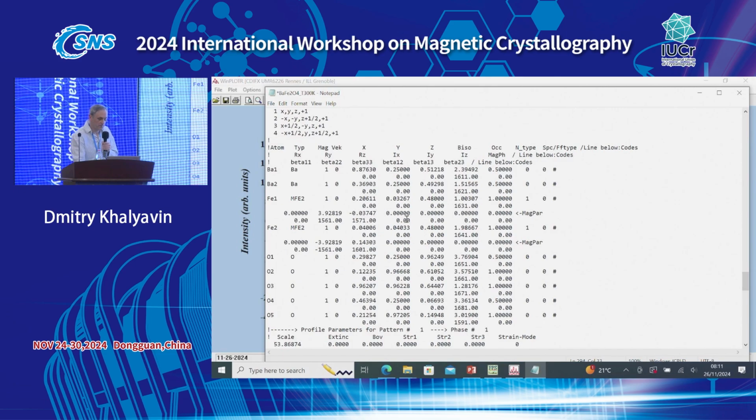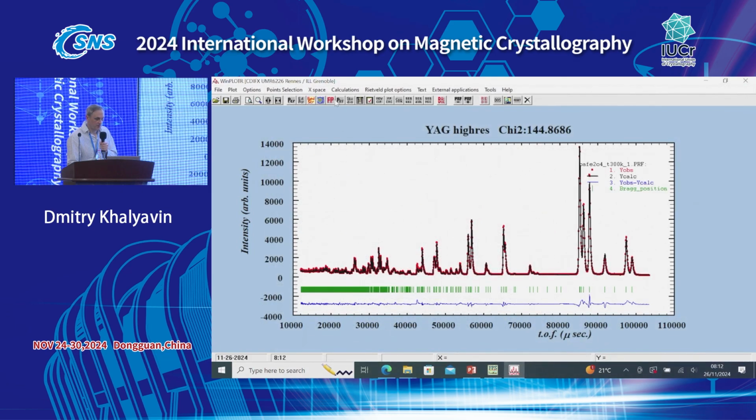And same for that component. Just zero. Okay, let's make sure that it converges now.